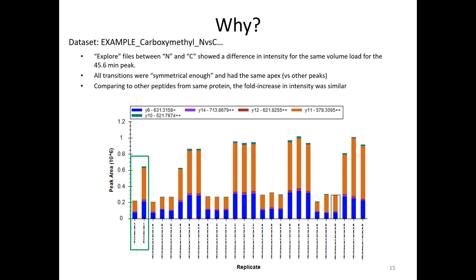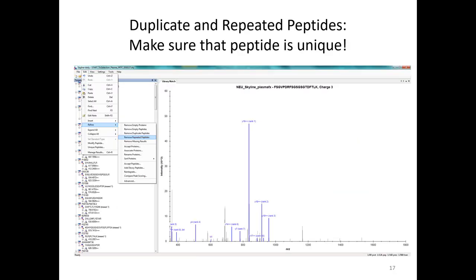Most of the other proteins and peptides we monitored in the sample, with the exception of a few, had no change. This was one that had change, and all of the other peptides from that protein showed this same one. And so that provides weight that it is probably the right peptide. Again, probably. Yes, more confidence, exactly.